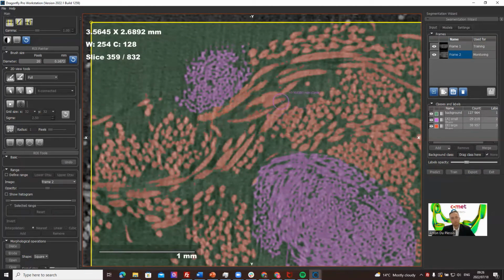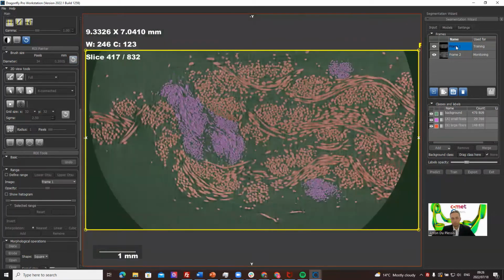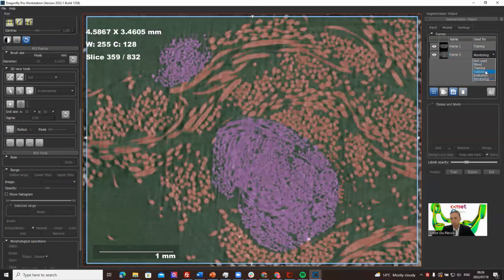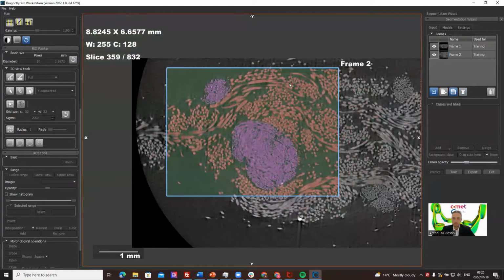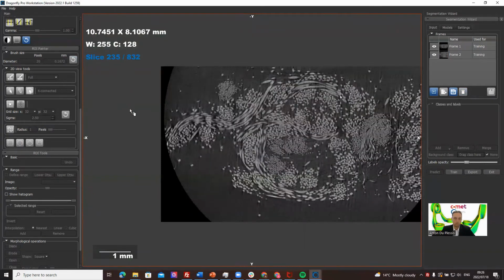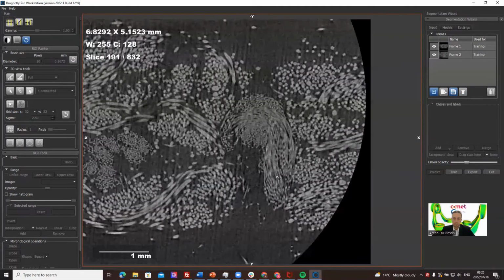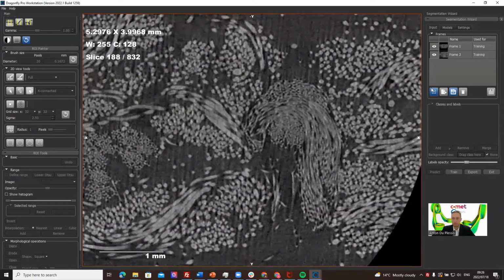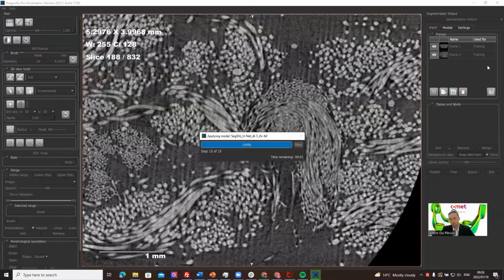In this way, the model will get stronger because if we look at this one, this is what we originally provided. Nothing changes to that because I fixed it as a training frame. This one we're now also happy with, so let's fix this also as a training frame. And we can go to a third frame. Let's take it quite far away. Let's have a look at this as another frame and as a monitoring frame for a next round of training.